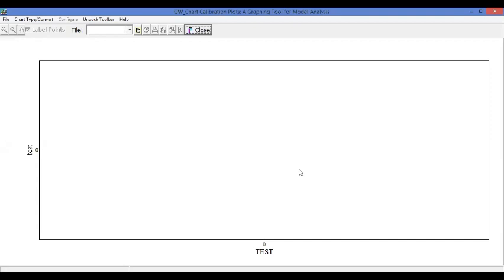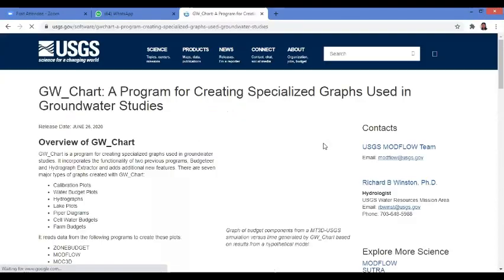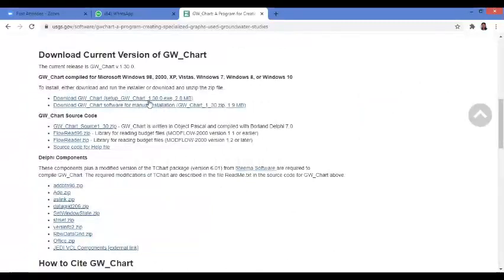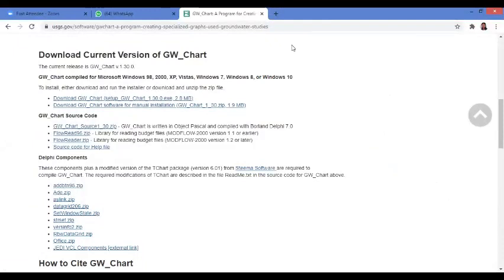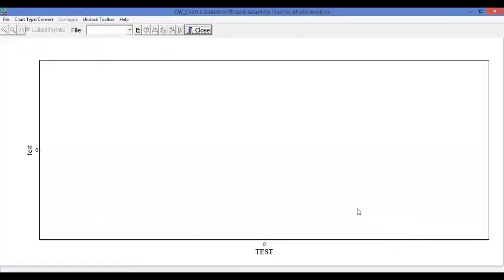For the GW Chart, search in Google for 'GW chart USGS'. Go to the USGS site, find the setup for GW chart, click it, and follow the installation steps. Once installed, this interface will open. GW Chart is used here specifically for the Piper diagram.